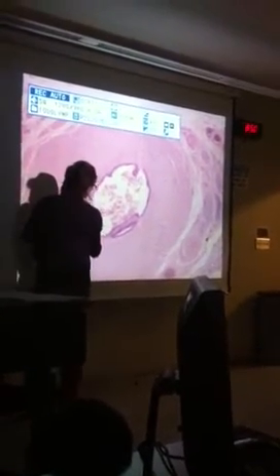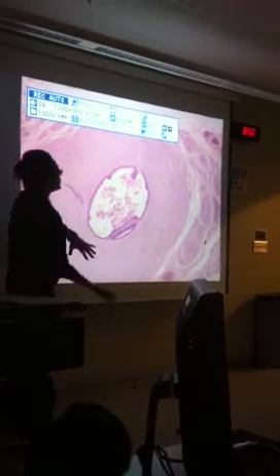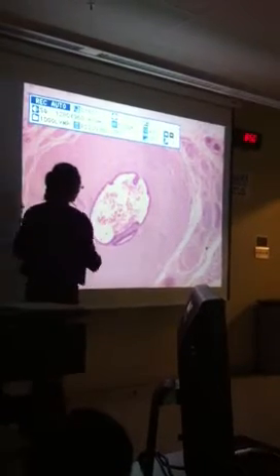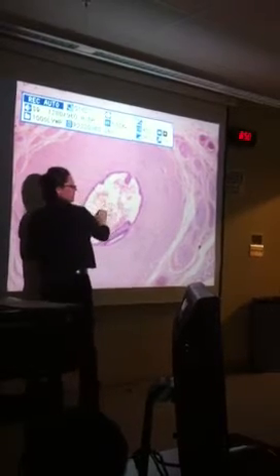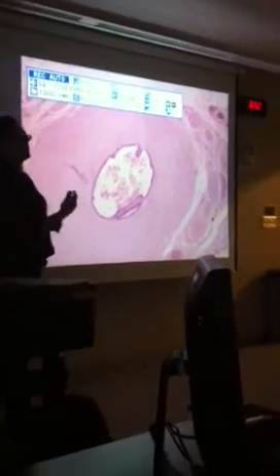And they look darker because they're so close together because they're epithelial cells. And you can see that these have kind of a columnar shape to them, particularly when you go to compare it to an artery or a vein that would be next to this. What you're seeing in here, these are actually sperm cells in the middle. So you may have a ductus deferens with sperm cells in it, you may not.